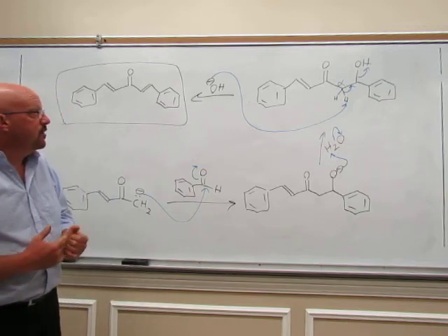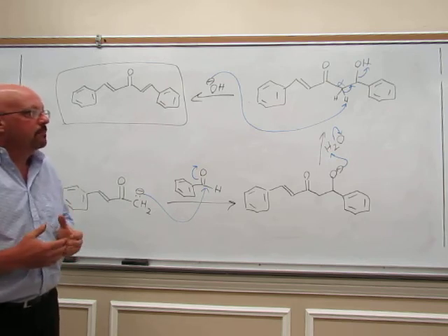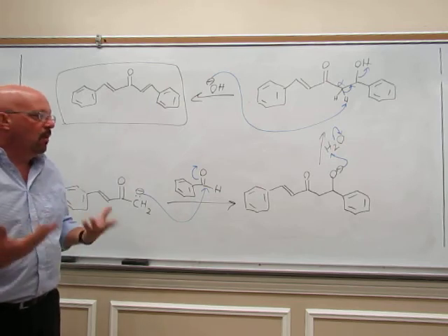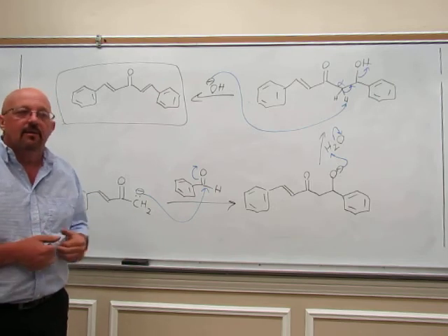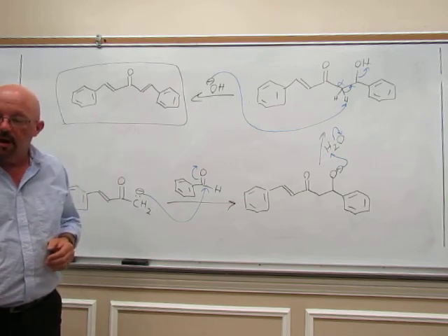Now again, as I mentioned, we will get the trans-trans. Any cis-cis or a cis-trans that might form, that will be removed by the recrystallization. We could see that with the melting point if we still have any of that in there. We know the melting point of the trans-trans.